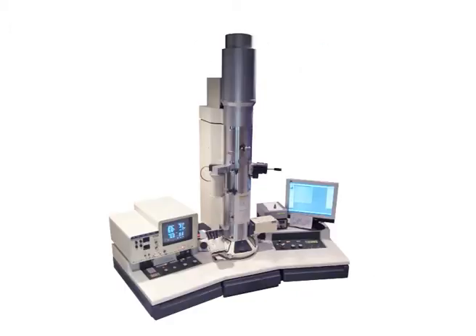In some cases even complete backscattering can occur, generating the backscattered electrons. Electron microscope utilizes all such interactions occurring between the matter and the highly accelerated electron incident on it. These transmitted electrons are focused with the help of electromagnetic lenses, and the very short wavelength allows the specimen to be imaged with a very high spatial resolution as compared to the light microscope.